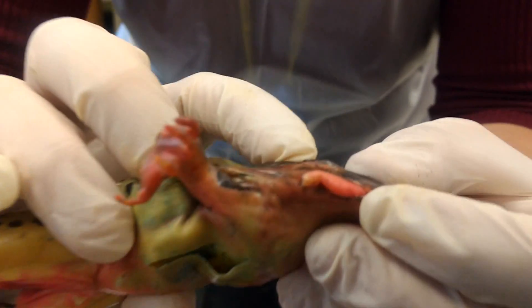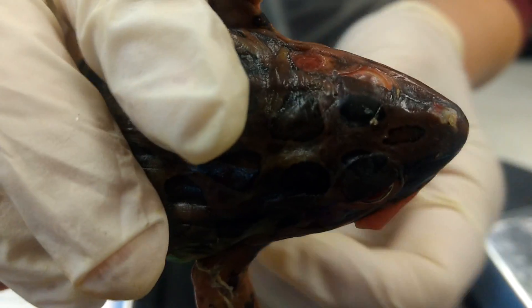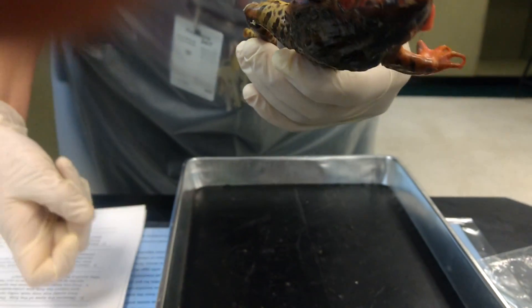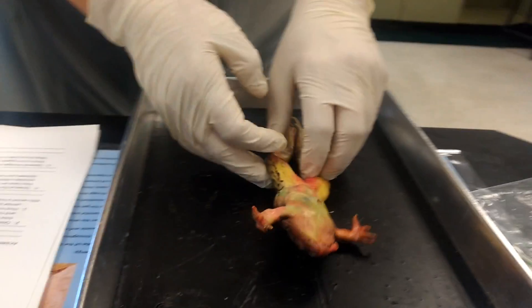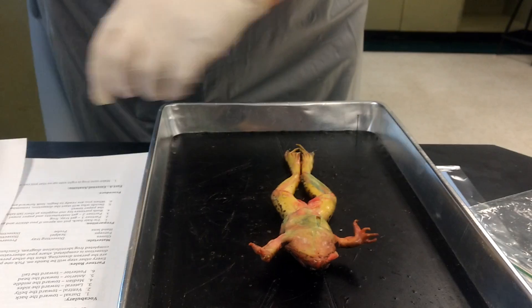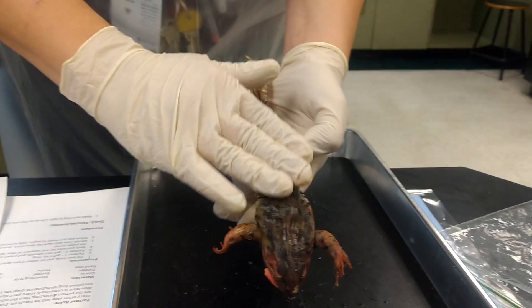Then we're going to look at the eyes. If you look at the eyes very closely, you can see they look smashed and a little odd, but we'll be able to look closer later. We also looked at the ventral surface and the anterior.